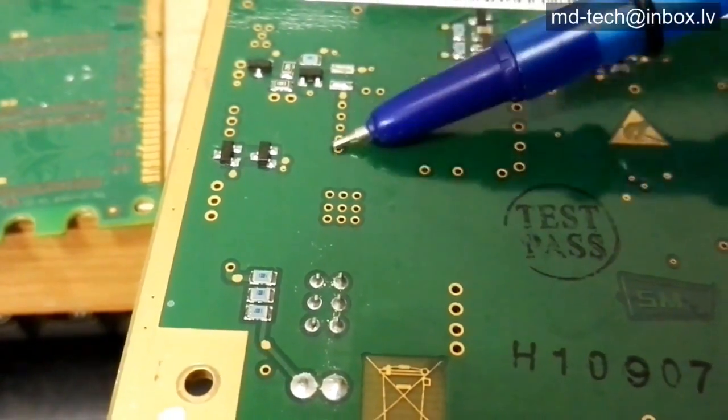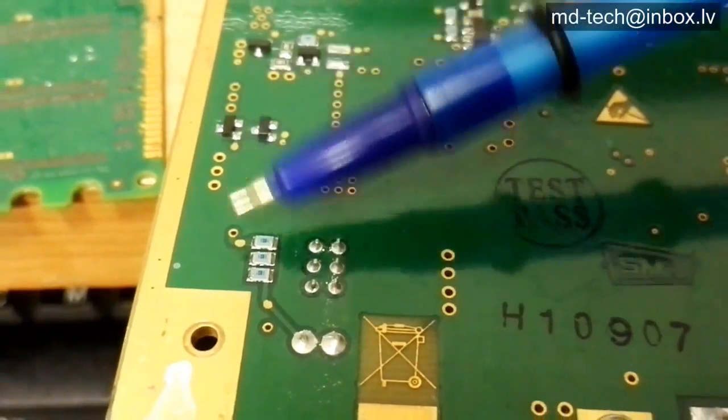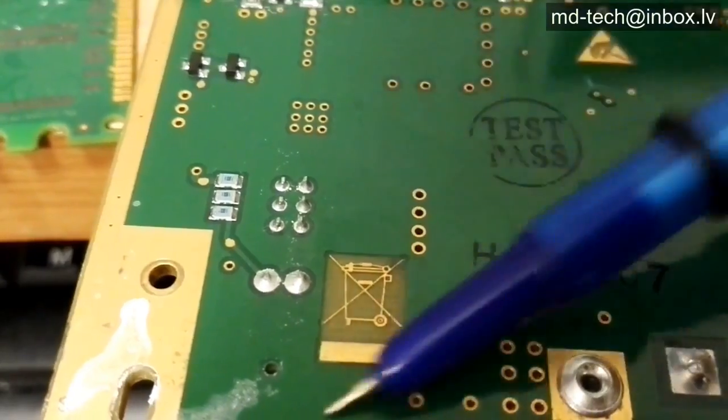These gold layers after solder stripping remain. But if gold pads are soldered, gold dissolves in solder and after solder stripping it falls down like black powder.